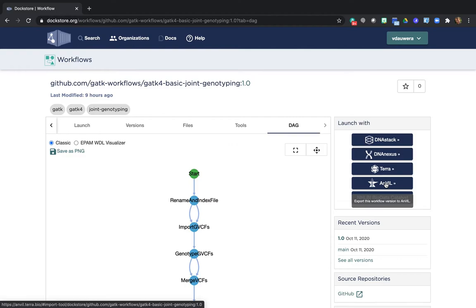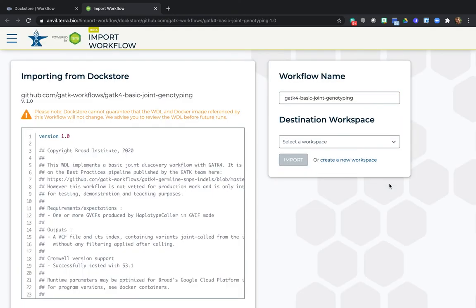But keep in mind that here, regardless of whether you choose Anvil or Terra, you'll have access to all the same resources and functionality. So there's really no wrong decision here between the two. So this takes us to the workflow import page.